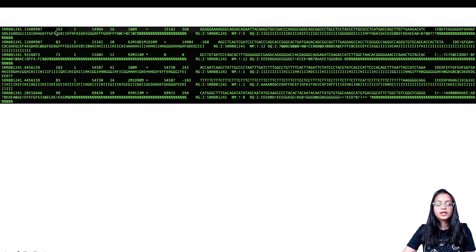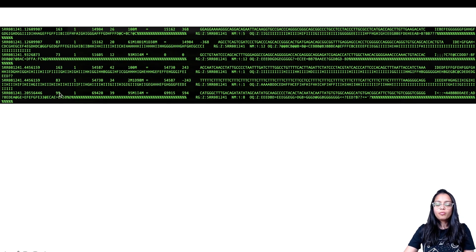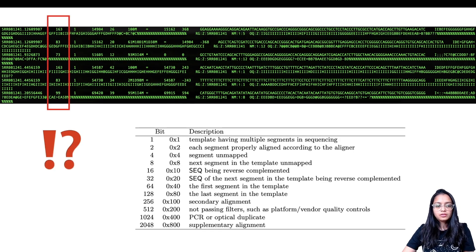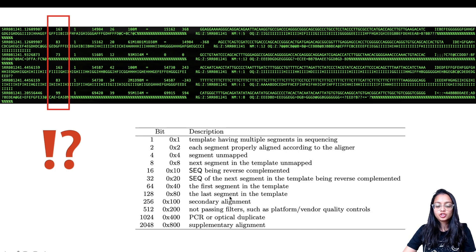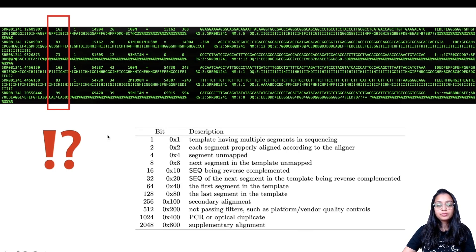Let's look at another SAM file. In the second column — the SAM flag field — you see the numbers 163, 83, 73, and 99. When you go back to the SAM flag lookup table, these numbers are not present directly. For example, 163 is not in the table, so you don't immediately know what features are associated with that read.